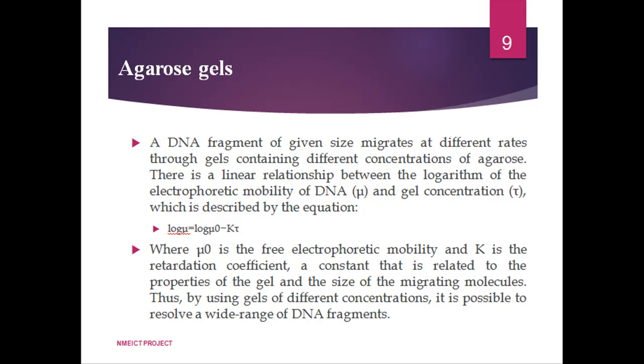native charge. Such large pore gels are also used to separate much larger molecules such as DNA or RNA, because the pore sizes in the gel are still large enough for DNA or RNA molecules to pass through the gel. Now, however, pore size and molecular size are more comparable, and frictional effects begin to play an important role in the separation of these molecules. A further advantage of using agarose is the availability of low melting temperature agarose.